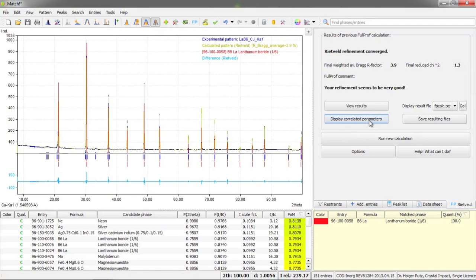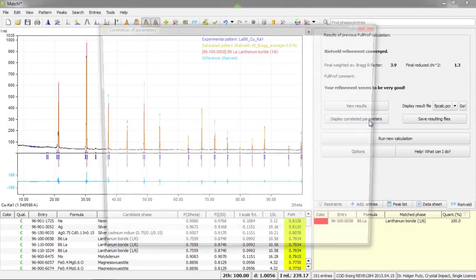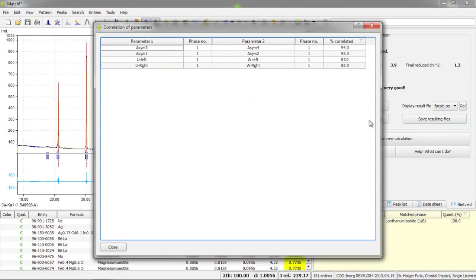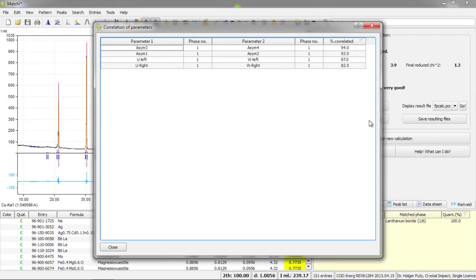Here is a button called display correlated parameters. And if I press this I will get a table of parameters that have shown to be correlated during the calculations. That is, they cannot be varied independent from each other. Parameters like these can cause convergence problems. So if your refinement does not converge, the first step to do is to take a look at this list.